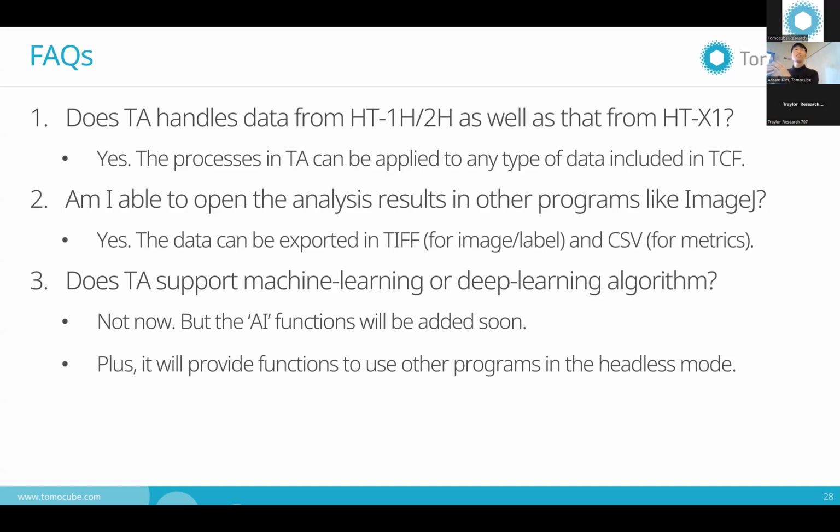But in this new system, it does not rotate. Instead, it simulates the rotation by modifying the illumination pattern. For the same pattern, we do Z stacks in the Z direction for about 60 microns. By accumulating and comparing those Z-stacked images, we can compute the RI distribution in 3D. Yes, that's the basic idea.